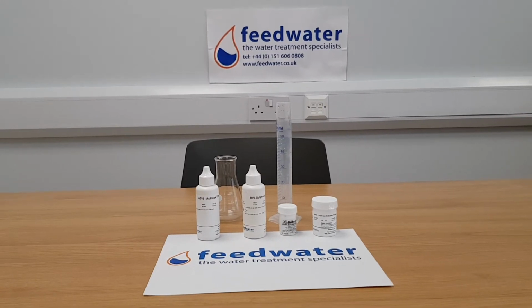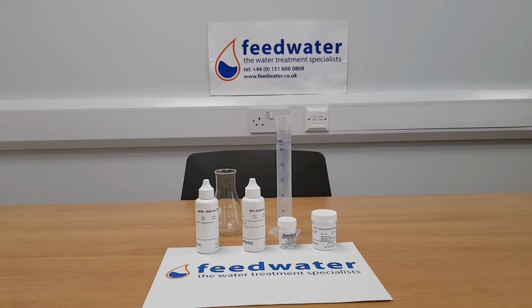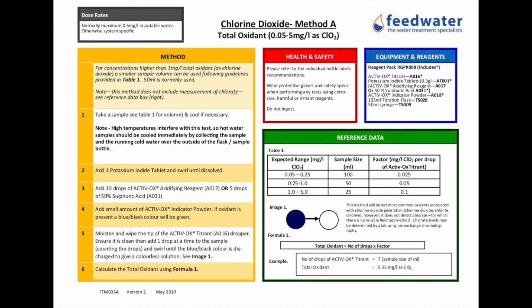Today we are going to demonstrate a field test method for measurement of total oxidant in water systems treated with chlorine dioxide. This is a titration method, and the reference code for this method sheet, should you need to request it, is FTM035A.